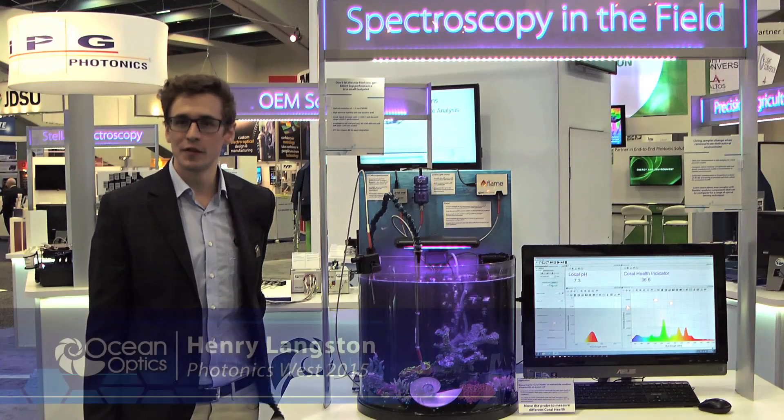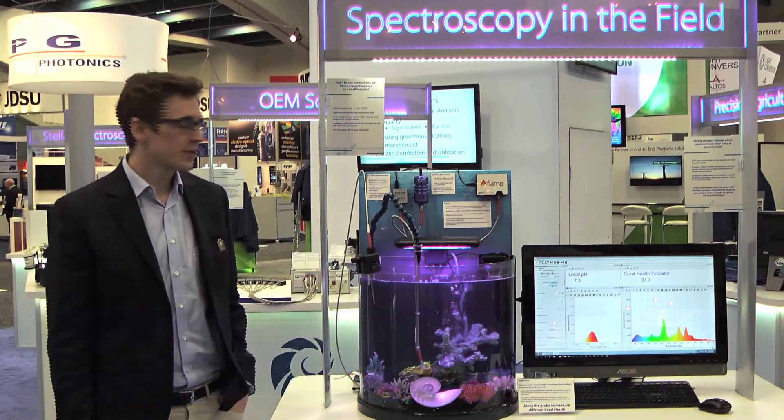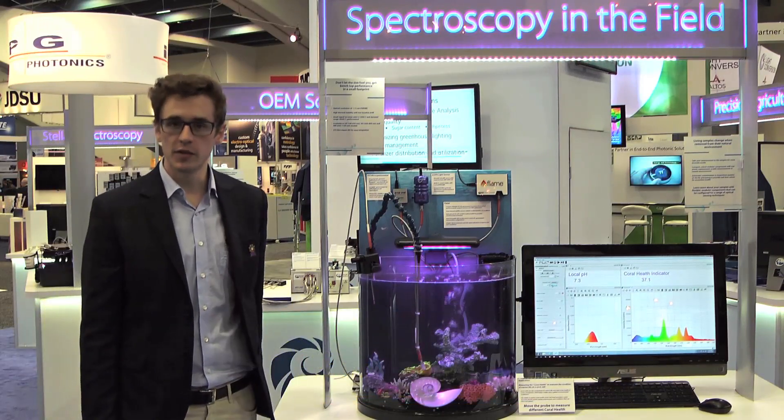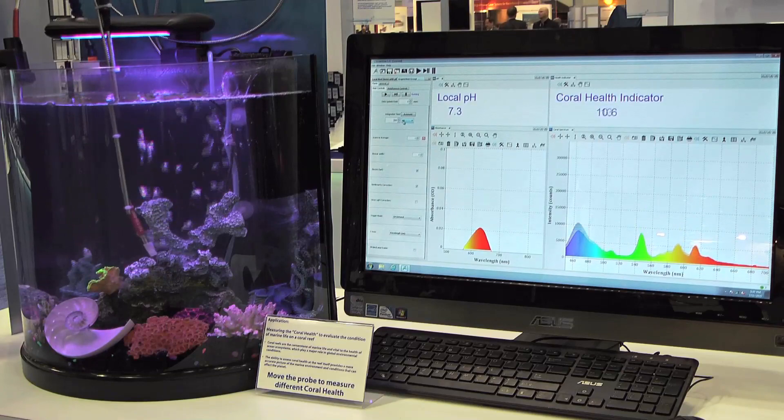Welcome to Photonics West 2015. Here we're showing spectroscopy in the field. OceanOptics was founded on taking spectroscopy to the sample, and today we're showing the first ever application that OceanOptics equipment did by measuring the pH of the water in this aquarium.